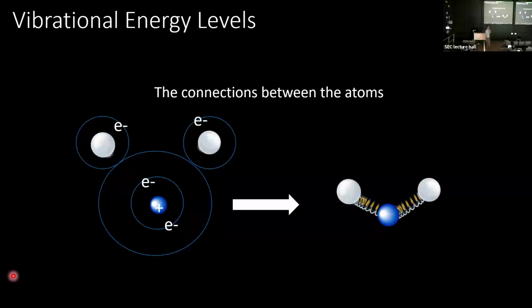So I was trying to draw a picture of water. Water, the chemical formula is H2O. The hydrogen I can draw, one proton, one electron. The oxygen, I'm already too lazy to draw all the electrons. So as a physicist, we're going to cheat and jump over to this balls and springs model. The balls and springs model lets physicists go, oh, I know how to deal with that. We'll call it a simple harmonic oscillator.